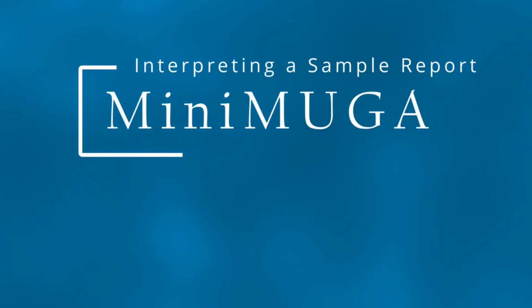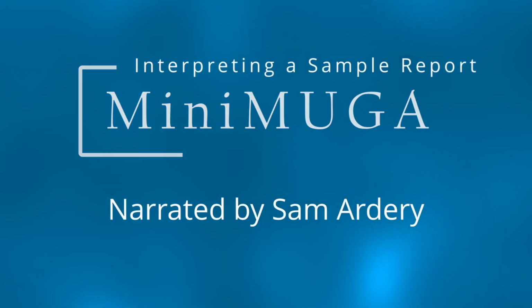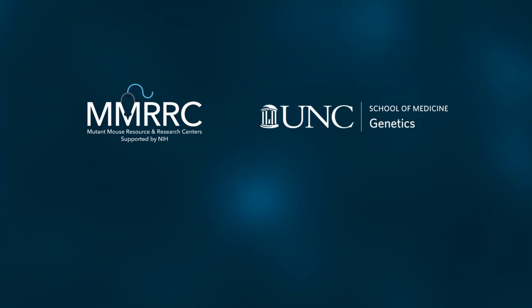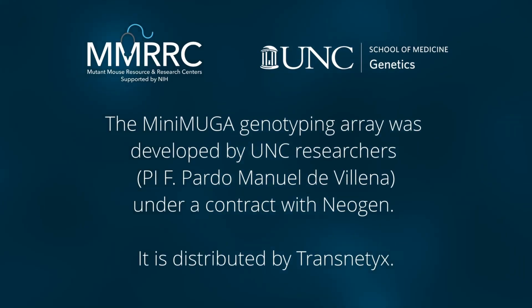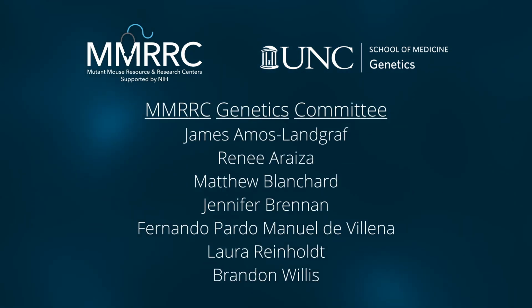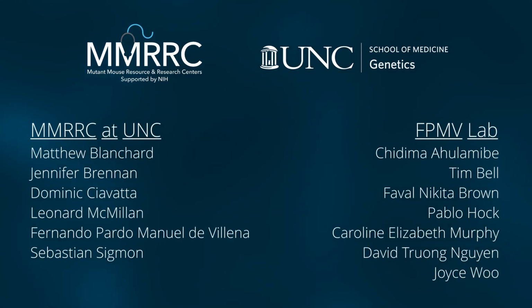In this video, we have seen several examples of MiniMUGA sample reports. We hope that this primer helps you to better understand your sample report. In the future, we will release an additional video explaining how the MMRRC has developed a customized pipeline to use MiniMUGA to perform standardized genetic quality control in the lines it distributes.